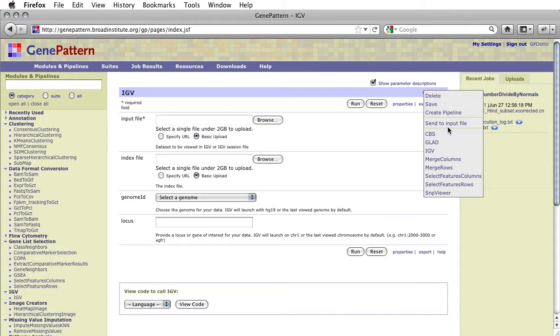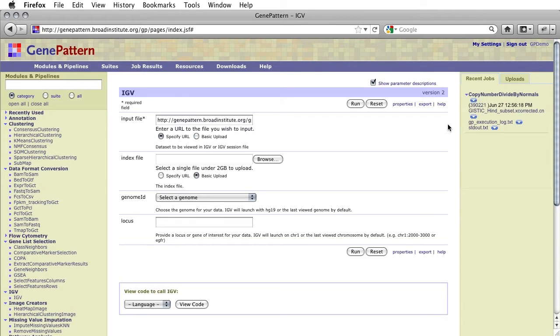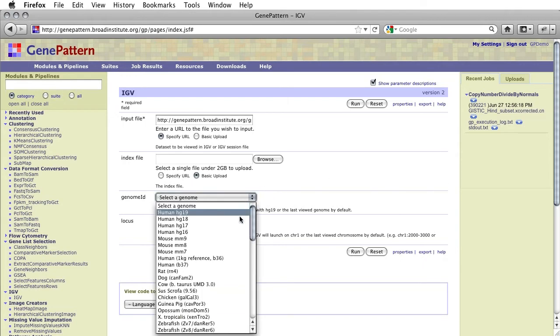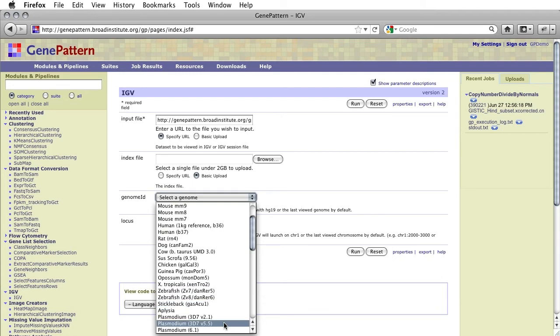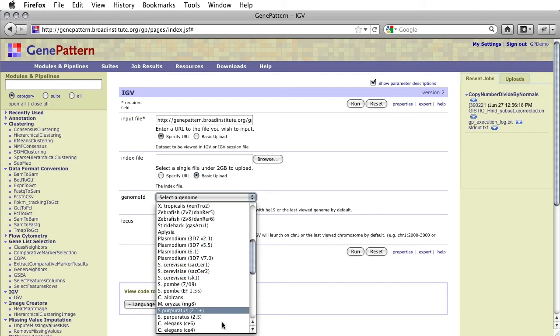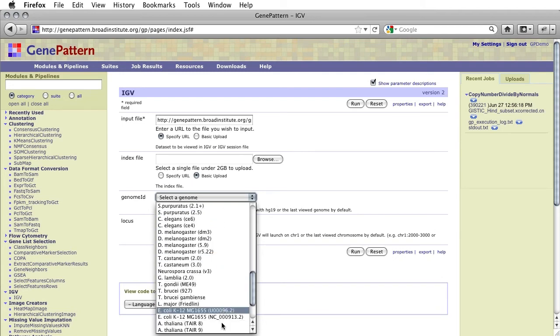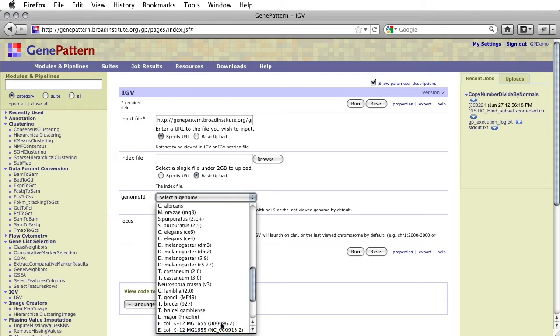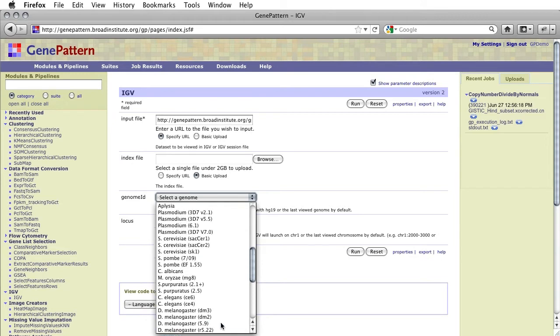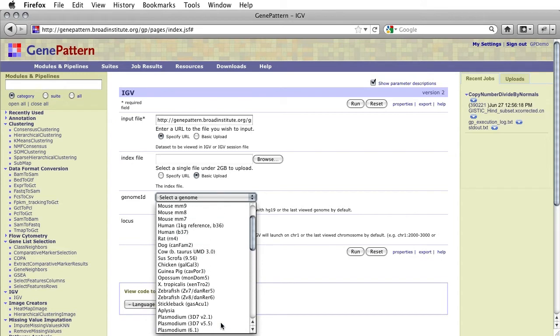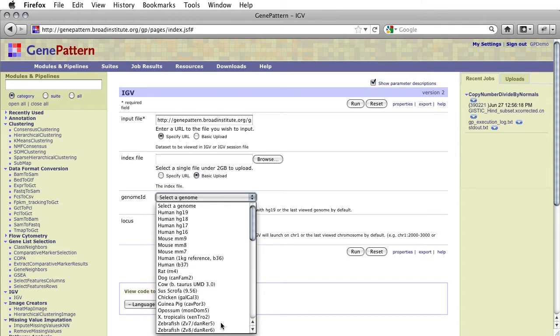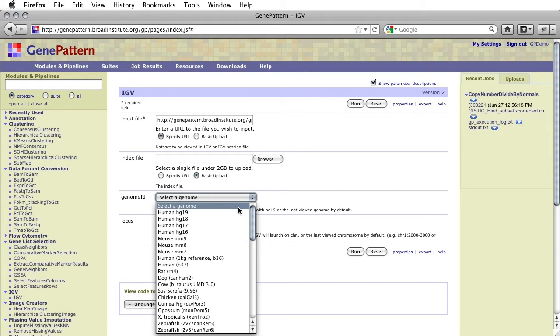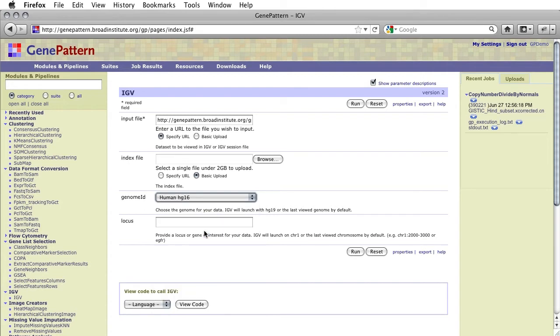For this tutorial, we will use the output of a recently-run copy-number-divide-by-normals job as input to the IGV module. We will now select the genome for our data. If we had recently opened IGV with the desired genome, or if HG19 were the genome for our data, we could leave this parameter unselected, as IGV will launch with the last genome used, or, if this is the first time launching, it will launch with HG19. For this tutorial, we will select HG16.